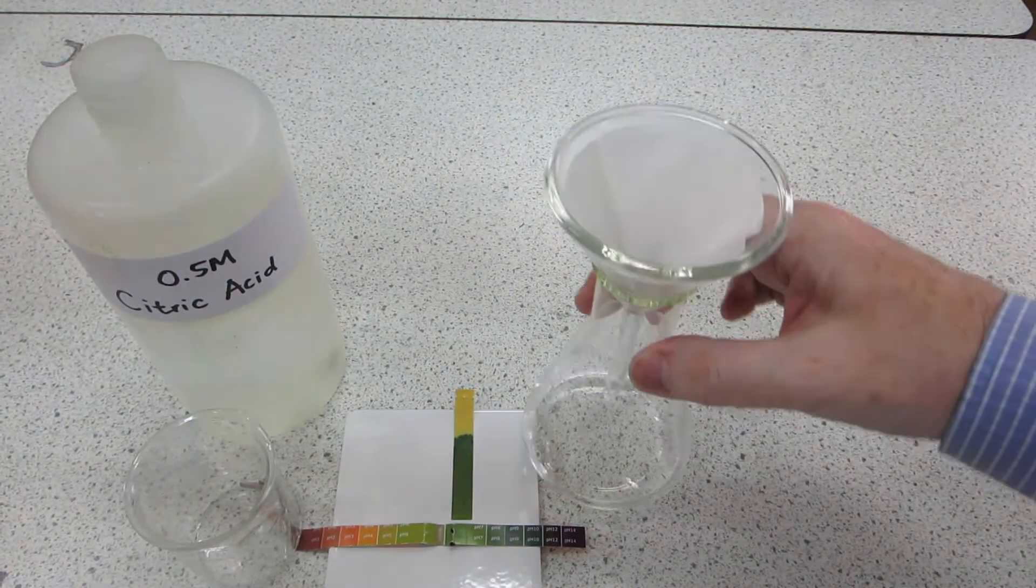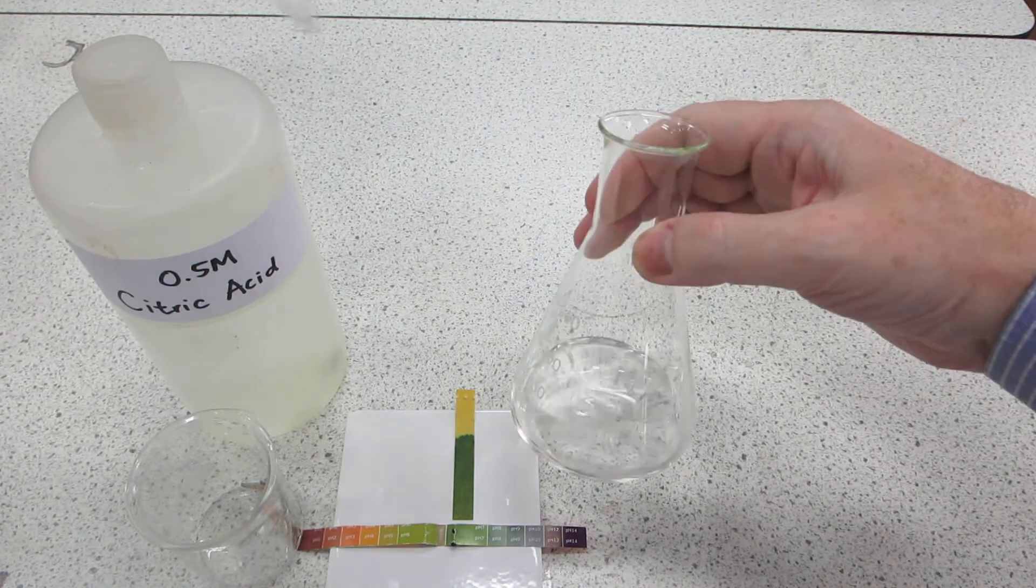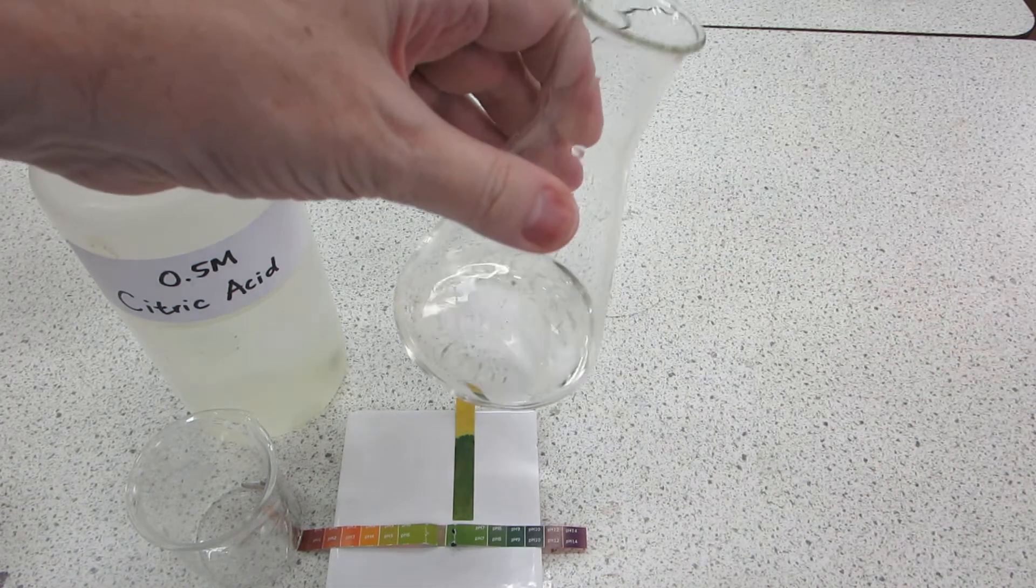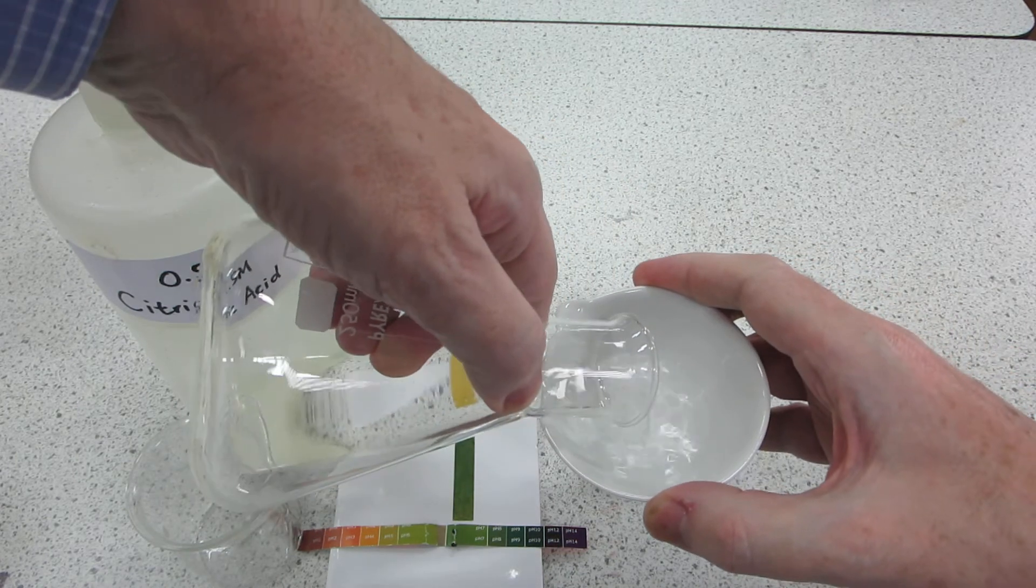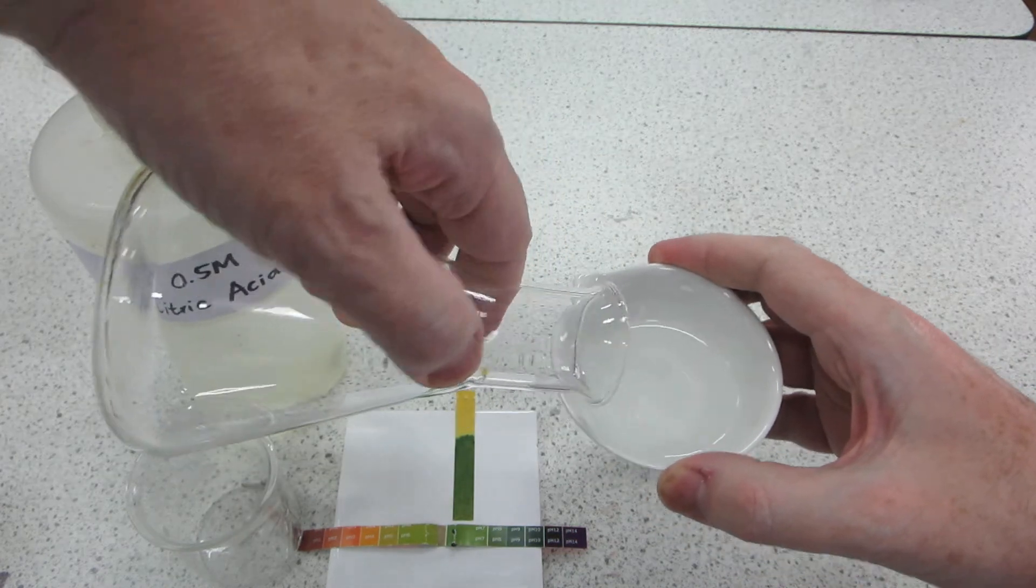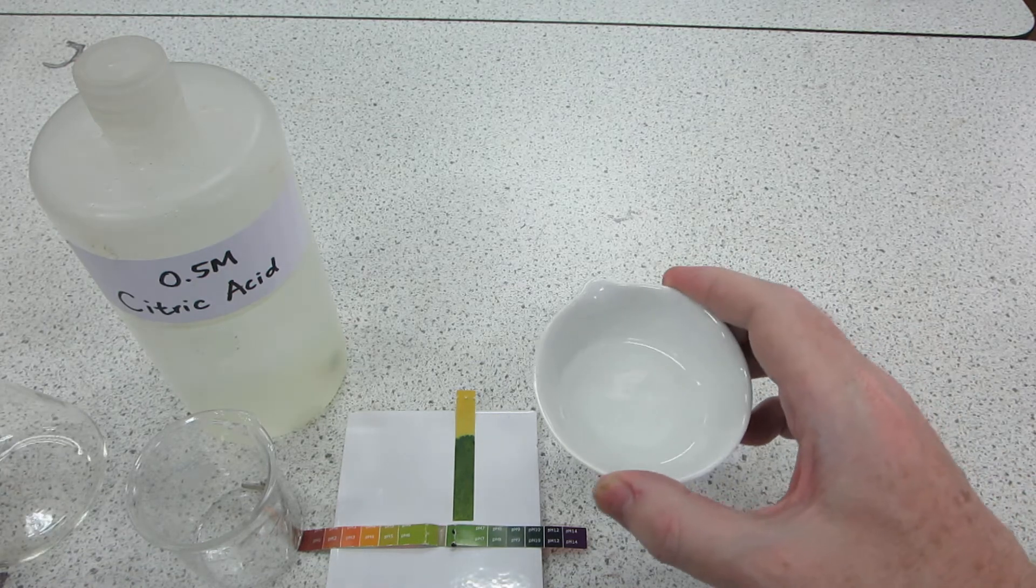Well now that the filtration is finished, the last thing to do is to place the filtrate in an evaporating basin and then place that in a low temperature oven in order to remove the water and obtain some crystals of the product.